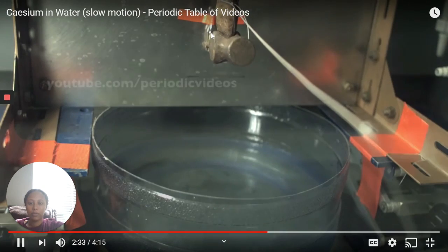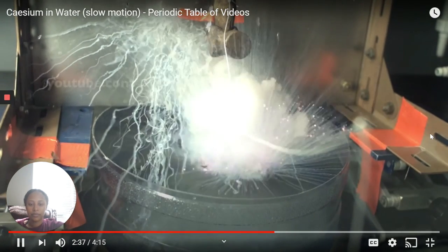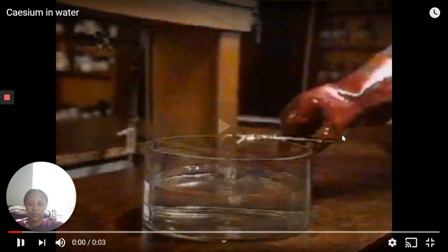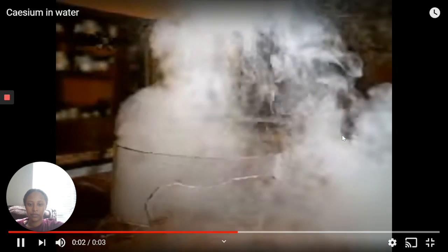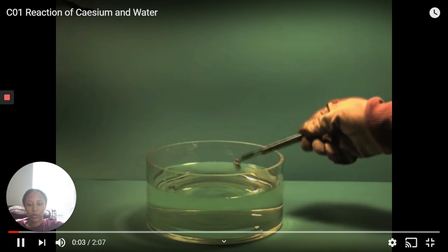So the metal cesium is over here and is going into the water. And this one is in slow motion to see what happens.